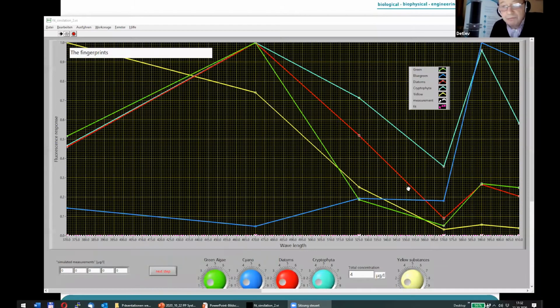This would also improve the quality of your analysis, but almost all of our users use this fingerprint as we propose in our instruments.